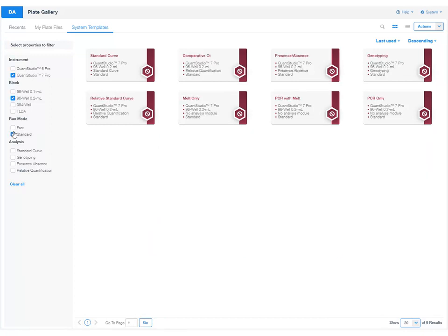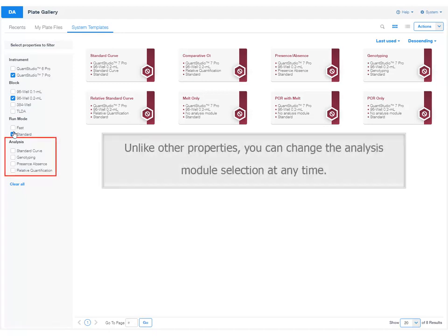You can also filter the selection based on the analysis module. But unlike the other properties, you can change the analysis module selection at any time.